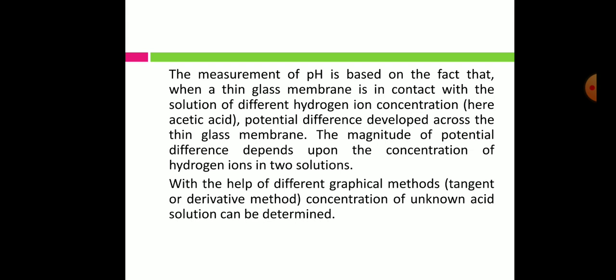Now, we will be recording the pH value of the titrating mixture from time to time by adding NaOH, and then we will be using those readings to plot a graph and to find out the equivalence point. What are we going to do? We are going to take a test solution. Into that test solution, our electrode will be dipped. Which electrode? The combined glass electrode. And then we are going to start the titration. We are going to add 0.5 ml of NaOH solution, and at every 0.5 ml addition, we have to stop and check the change in the pH values. And these pH values will be noted down.